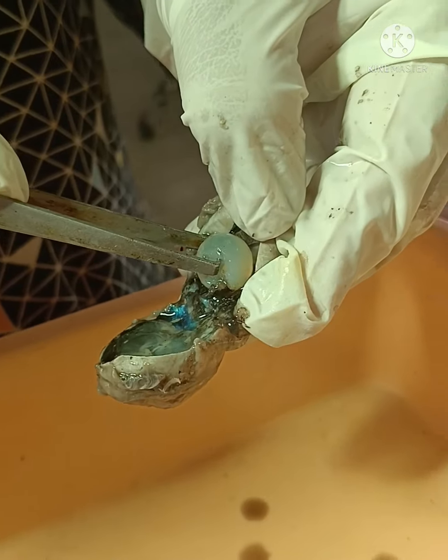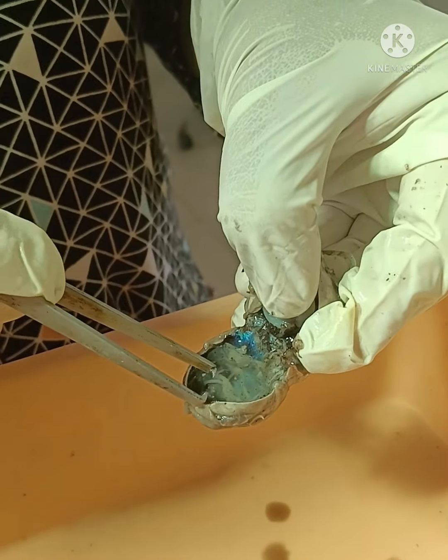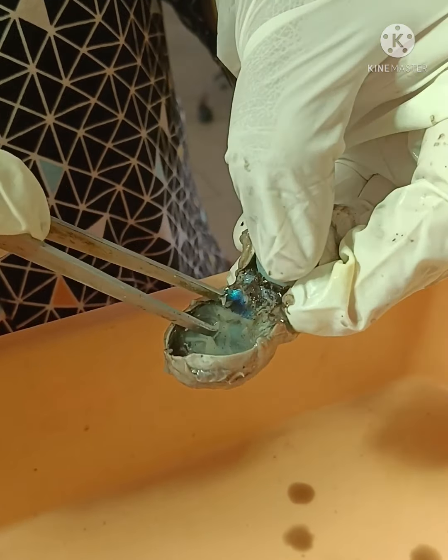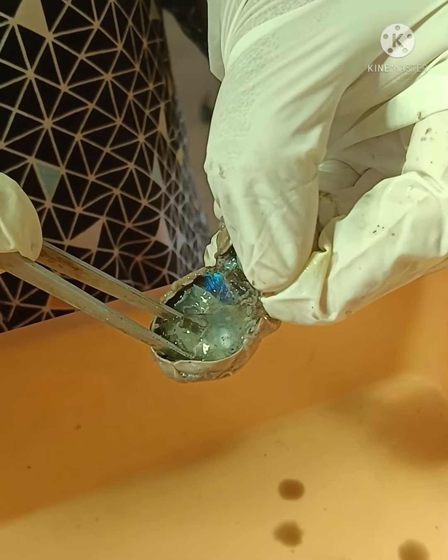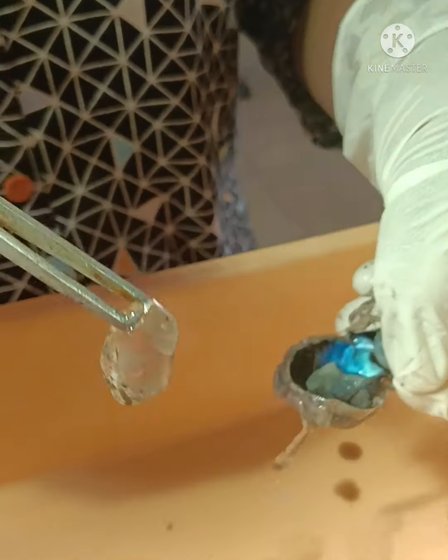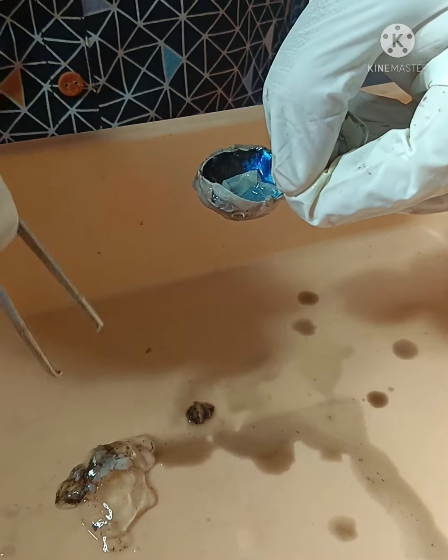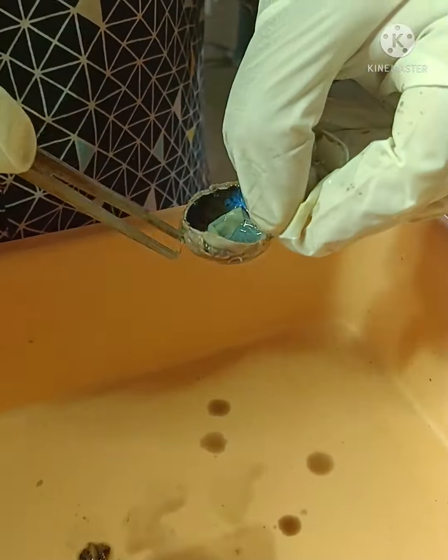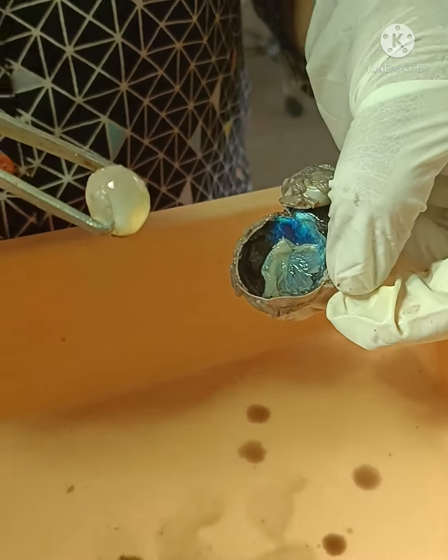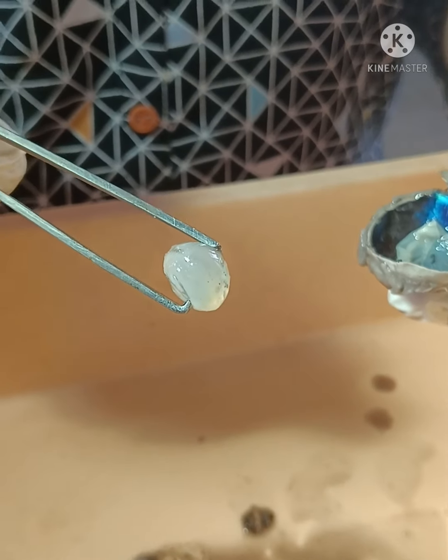Anterior to the lens is the anterior segment. Posterior to the lens is the posterior segment. The anterior segment is occupied by the aqueous humor. The posterior segment is occupied by a jelly-like structure, which we call the vitreous humor. Once we remove that vitreous humor, we can see the posterior segment here. The lens is a biconvex, very transparent part.